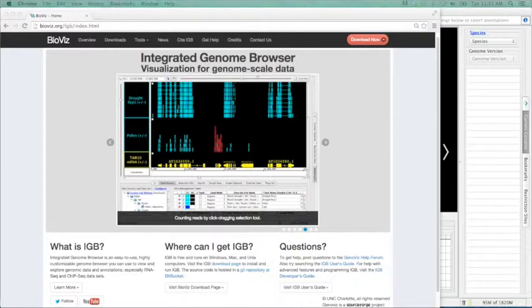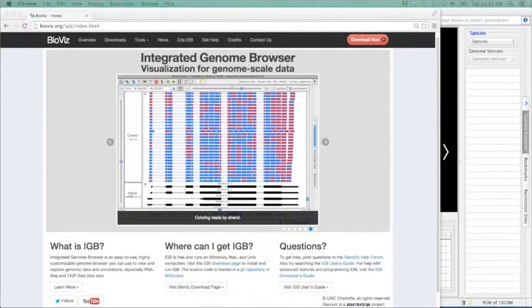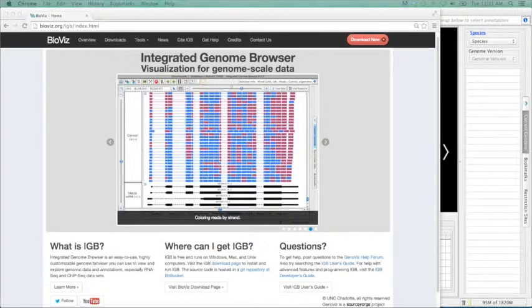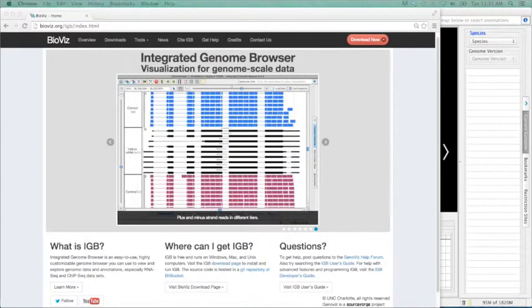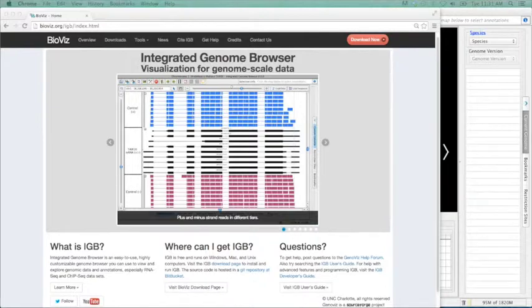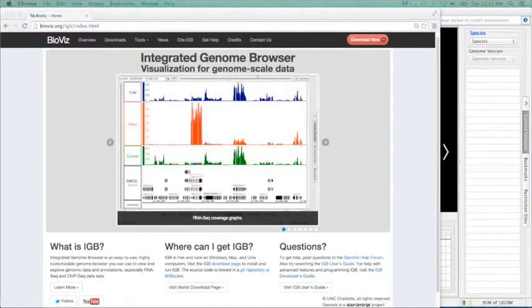Welcome to the first of what should be many monthly Focus on a Feature online tutorials using the Integrated Genome Browser, or IGBI. My name is Nolan Fries, and I'll be your virtual host. Today we will be going through the process of visualization of alternative splicing events in IGBI and how to go about designing primers to test these observations.